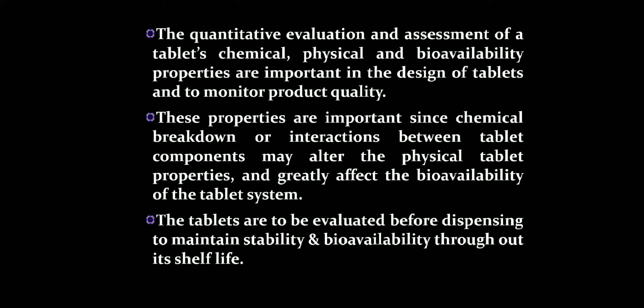These properties are important since chemical breakdown or interactions between tablet components may alter the physical tablet properties and generally this may have an effect on bioavailability of the tablet system. The tablets are to be evaluated before dispensing to maintain stability and bioavailability throughout the tablet shelf life.